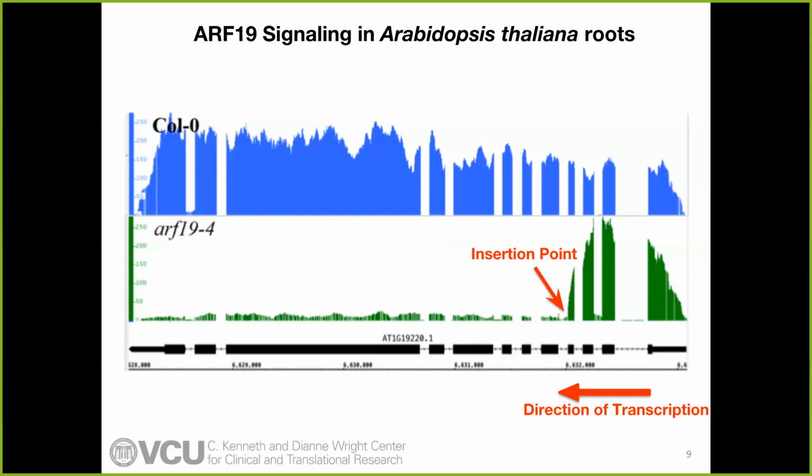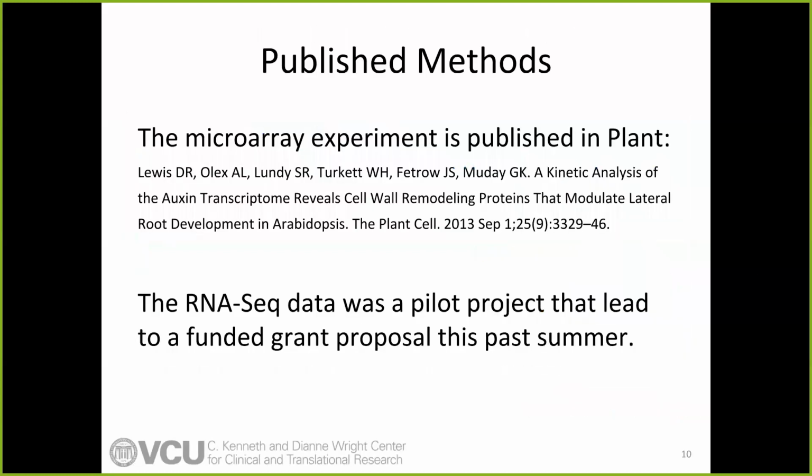So, Amy, given this data and giving it to the biologist, to make it cleaner, you'd want that insertion point prior to any initiation of the transcript. I mean, they say it's non-functional, but you don't really know what else it could be doing in there. Right, and that was my question.